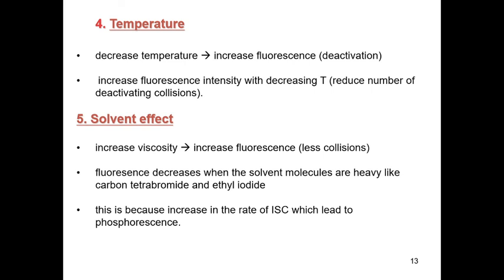Coming to the solvent effect. Solvents with lower viscosity have a higher possibility of deactivation by external conversion. That means the molecules will give their energy to the solvent system, and hence there will be radiationless deactivation. To avoid this, we have to increase the viscosity of the solvent. If we increase the viscosity of the solvent, there will be increased fluorescence, also because there will be less collision.